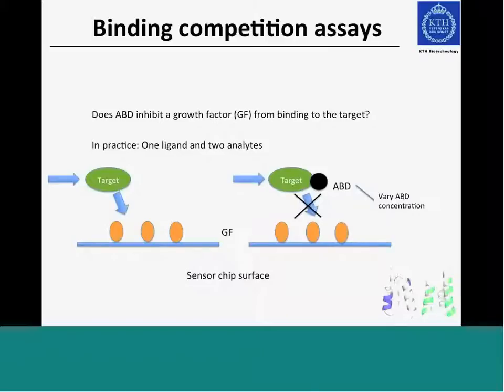So in this example here, you will have one ligand and two analytes injected simultaneously. So this will not be a co-injection, it will just be pre-incubation.